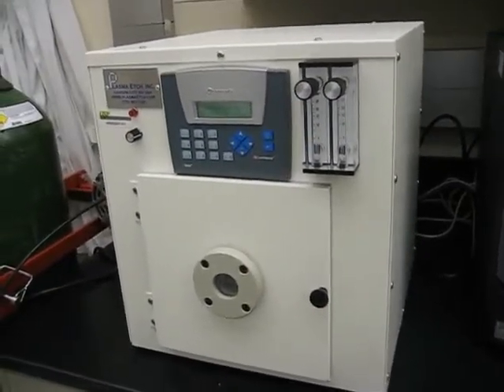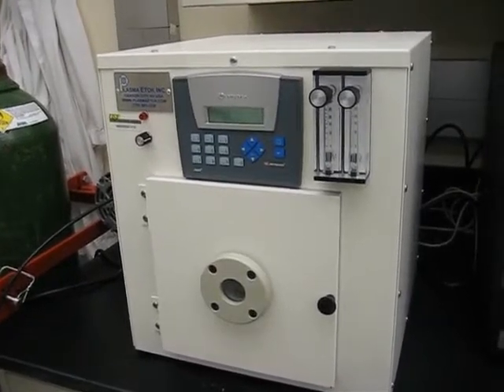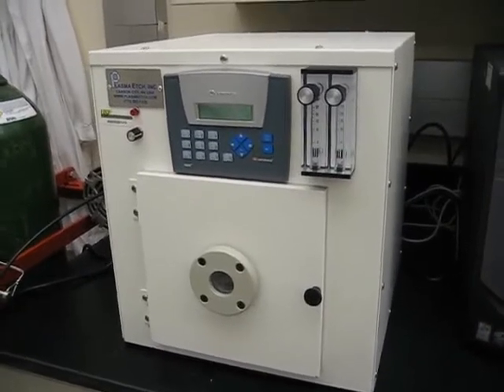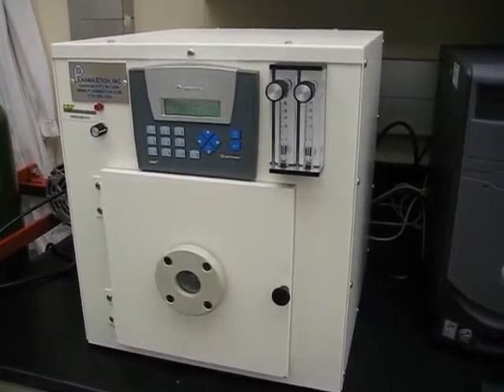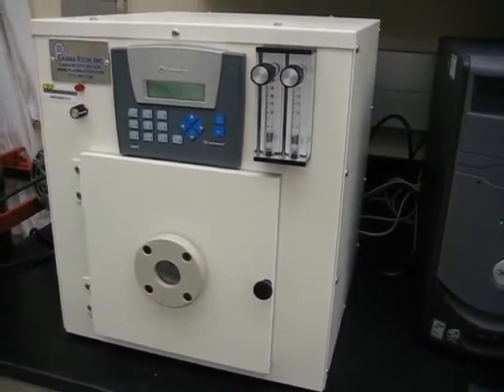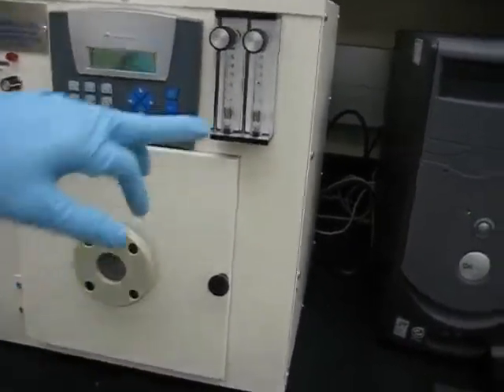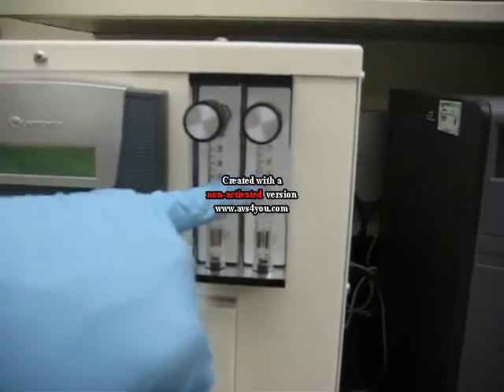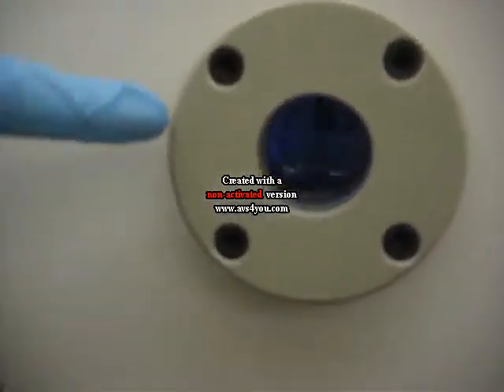The set point is at 500 millitorr. That's relatively high, but it suits our purposes. It's getting down there now — it just kicked in under 500. The gas is stabilizing right now in the chamber, oxygen is purging in with a flow rate, and now the plasma initiates automatically.